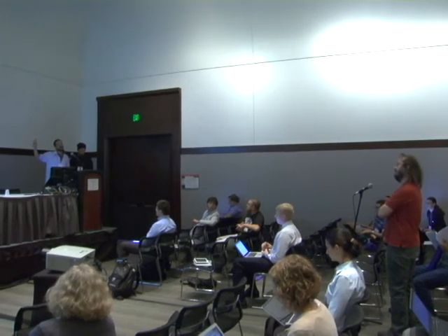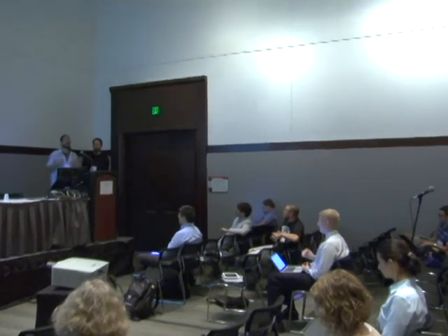The limiting factor is, to my mind at least, the microscopy. People always say you can track everything in the worm community. They tend to say that, but when they mean everything, they mean 80 to 90%, and you spend an exponential amount of time discovering which are the 10 to 20% you can't track. So we're pushing it to a later data set right now, actually. It just hasn't been integrated with the app yet.